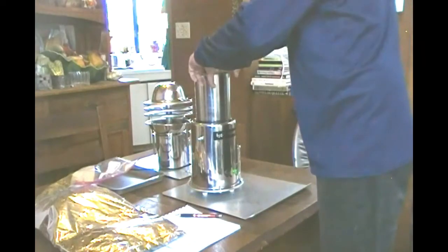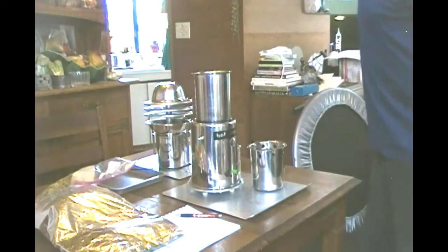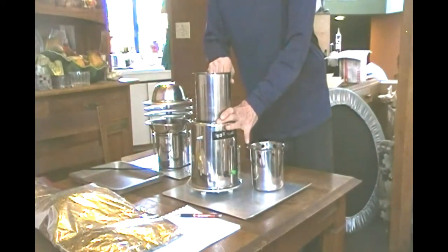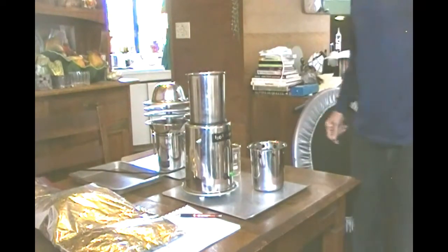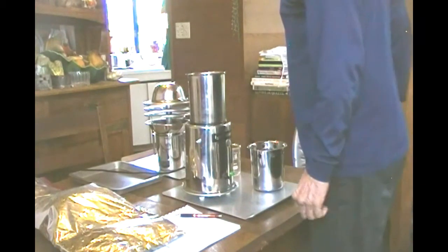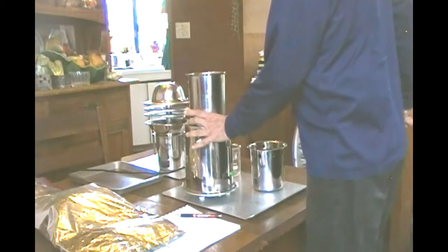Okay, we remove the extraction basket. And now we're going to set it up in water bath mode. First of all, what we have in here is very dark alcohol oil mixture. And the bulk of the alcohol is gone. There's still enough to make it squishy and pliable and able to be rinsed out.